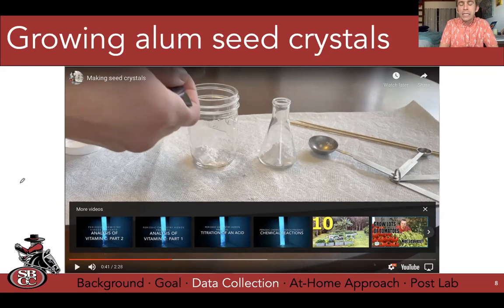But I'm just trying to give you as much actual lab advice as possible so that when you guys are all in organic chem labs, you have that. So we want to try to minimize using any kind of funnel and use something like this so that we limit how much error we introduce.